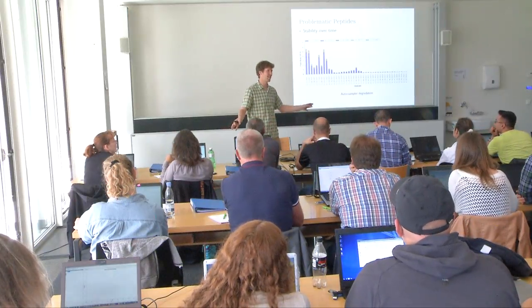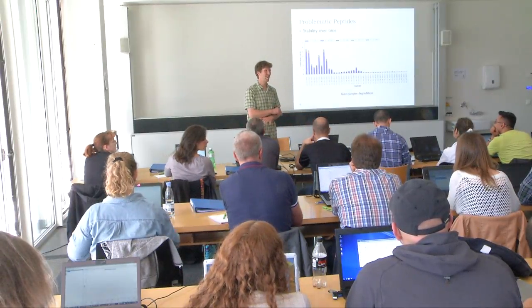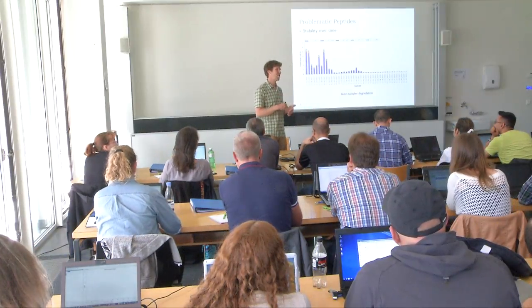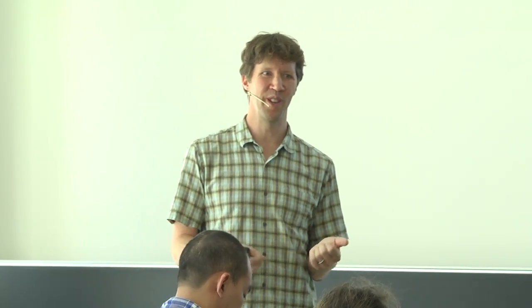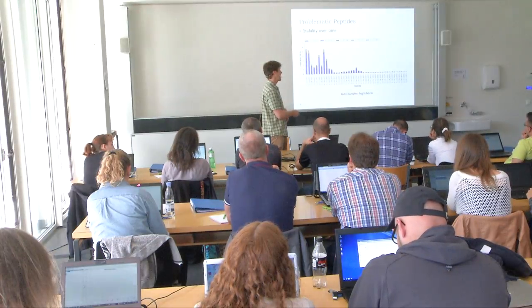So there's no synthetics in this experiment at all. No labeled peptides, no synthetics. The whole point of this experiment was just to see how far we could get without ordering and without paying. At the McCoss lab, we have a lot of instrument time. We don't have a lot of money for synthetic peptides. So the idea was to see how far you can get in a quantitative assay before you actually order the synthetic peptides. And we're pretty sure that this is actually degradation in the autosampler.